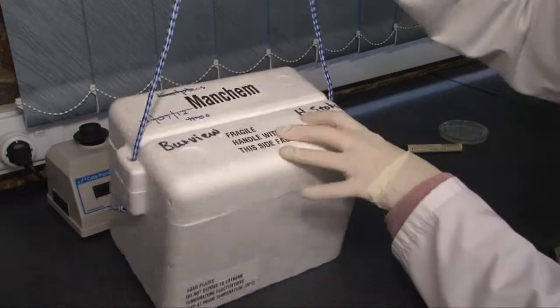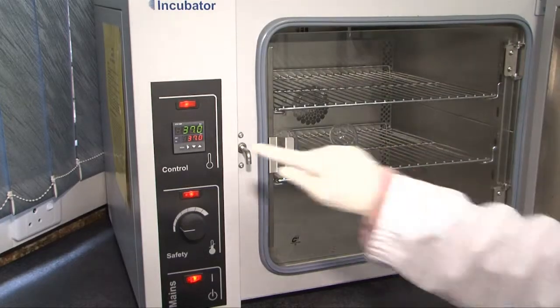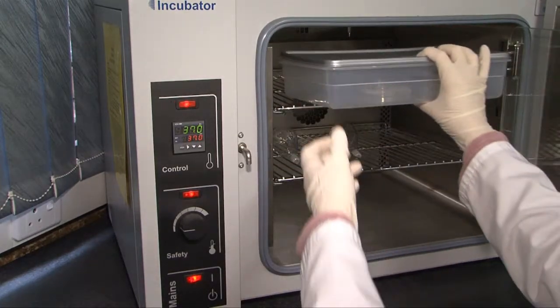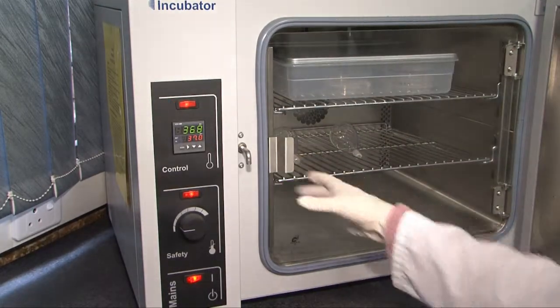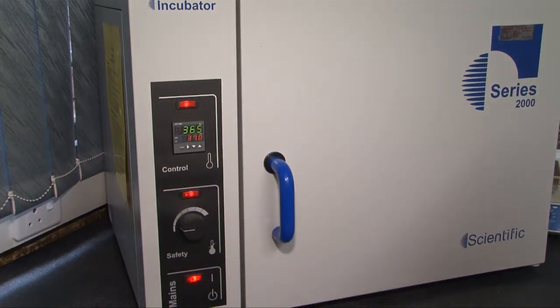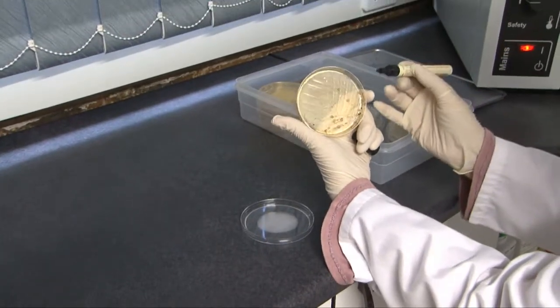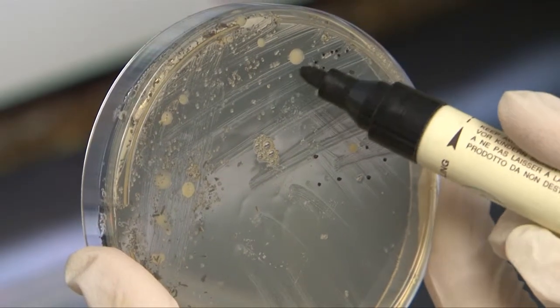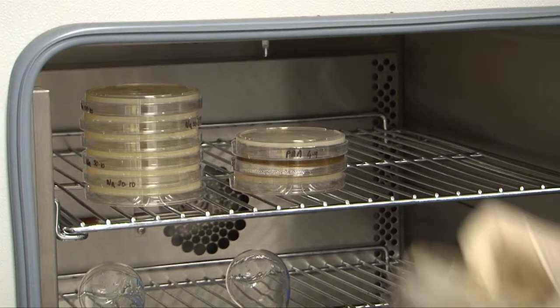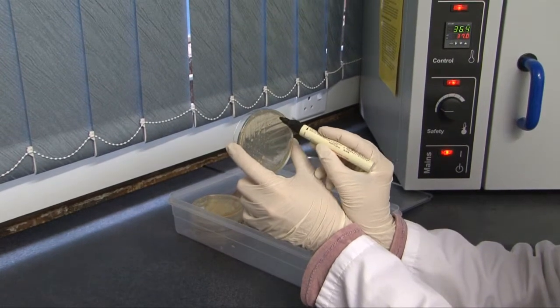Transport the exposure plates post-haste to the laboratory. When the samples get to the lab, the swabs are processed and incubated at 37 degrees Celsius for 24 hours. If you are using the contact or exposure plate method, the inverted Rodac plates and exposure plates are processed and incubated at 37 degrees Celsius for 24 hours. After 24 hours, the plates are removed from the incubator and examined for bacterial growth, and bacterial colonies are counted. The Rodac and exposure plates are then incubated at ambient temperature for a further 24 hours and a fungal count is done. The presence or absence of fungal pathogens is noted and recorded.